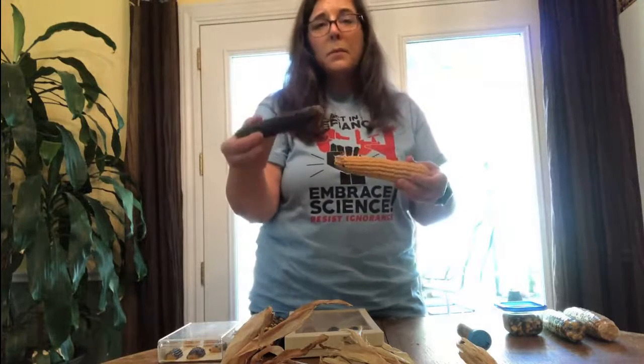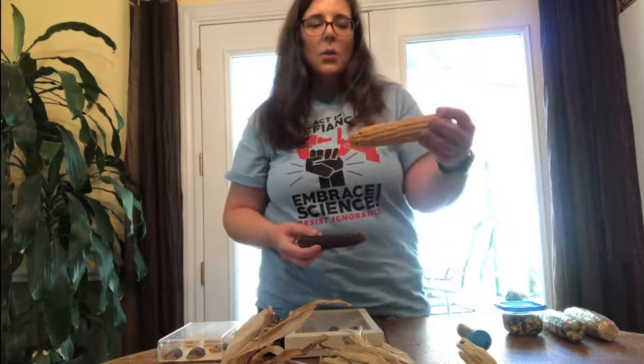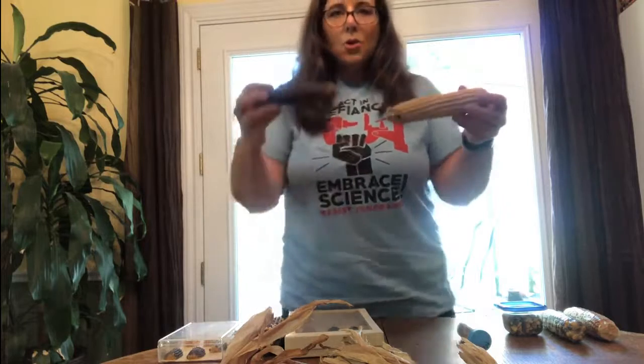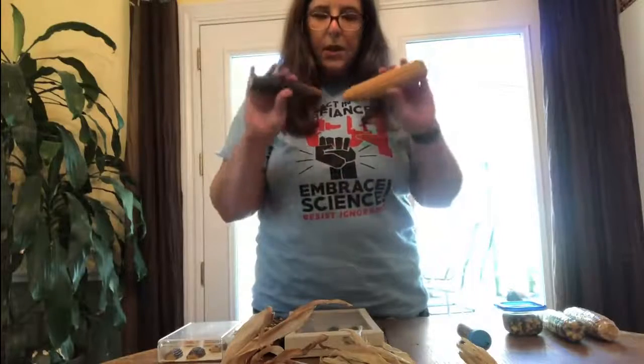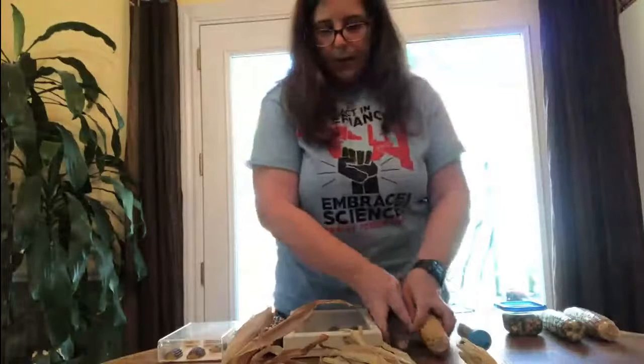I call it pigmented because it has pigment. And then we have a non-pigmented variety, which we would typically call yellow, but that's just because there's no red to cover up the yellow. So we're going to be working with these two as the parentals: our pigmented versus non-pigmented type.